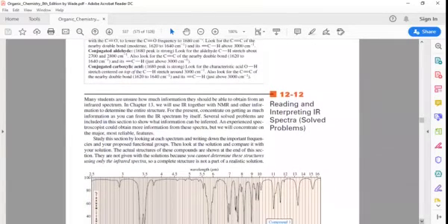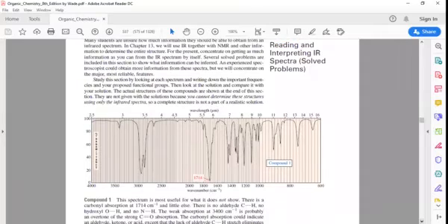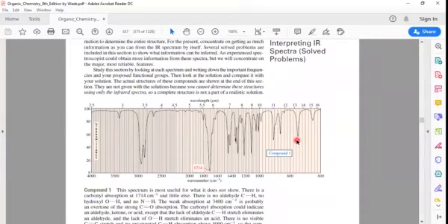Okay, now let us have some compounds and their spectra, and keep this in mind: visual impact is very, very important, and an IR spectrum is best interpreted through your eyes. Look and identify the peaks, and then you will be able to tell as many functional groups as you can. For example, quickly we can make this observation. This peak is so prominent that we cannot miss it, and it shows a carbonyl. And here this 3000, always keep this in mind.